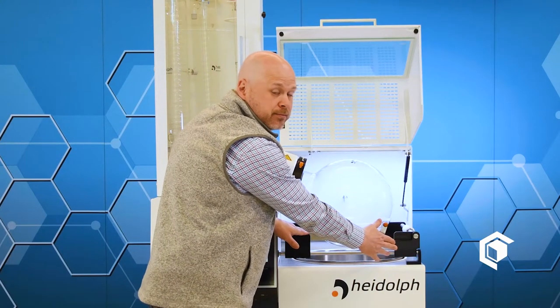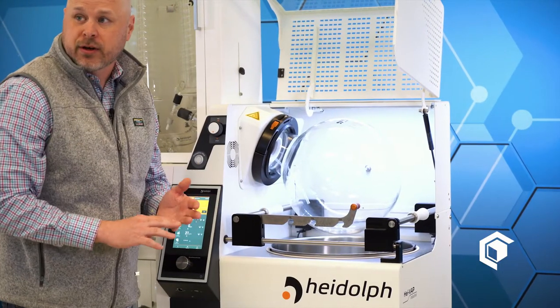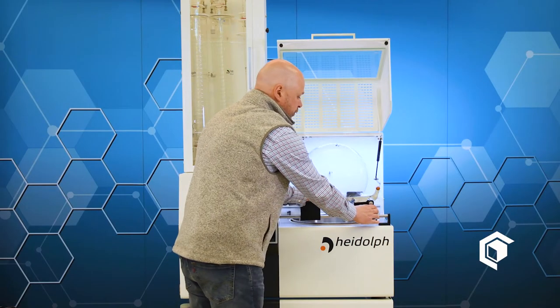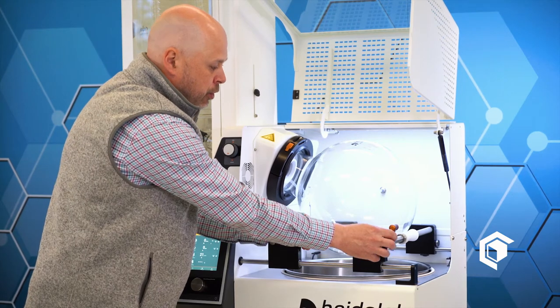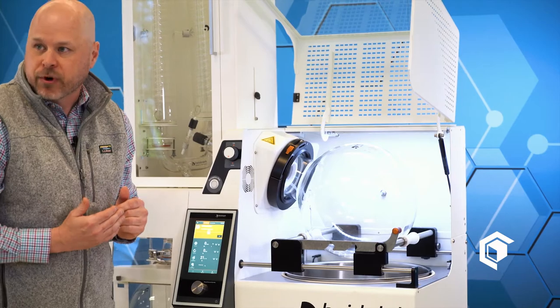These are the support rods. The support rods can actually support a 6-liter, a 10-liter, and a 20-liter evaporation flask. This is a 20-liter flask, so you put it on the 20-liter notch. You just put it right here — these are the support rods — and you can see it fits right underneath the evaporation flask.